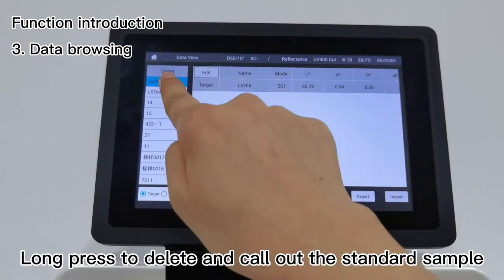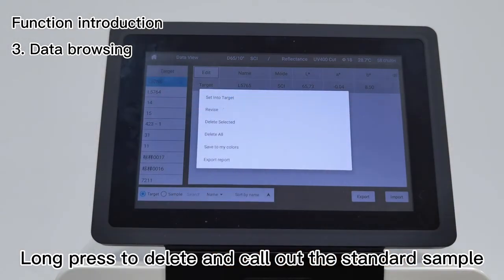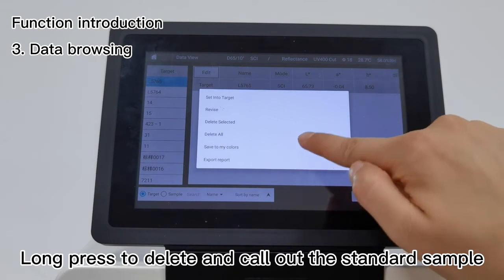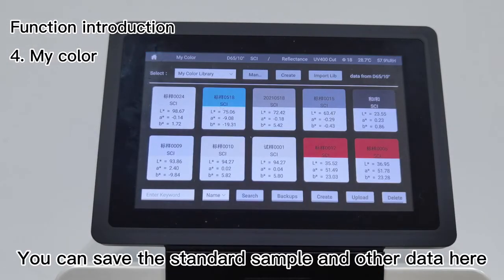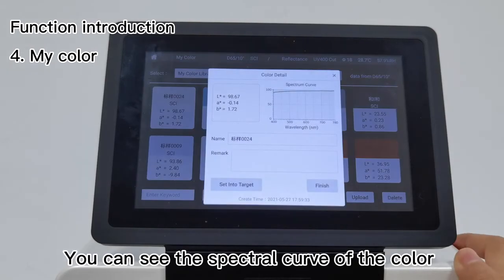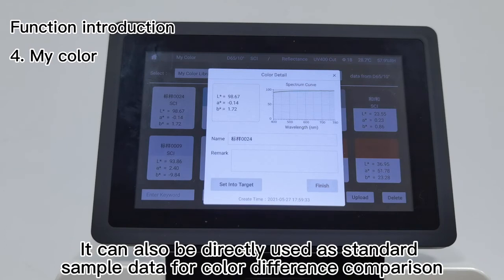Module 4 - My Colors: You can save the standard sample and other data here. You can see the spectral curve of the color. It can also be directly used as standard sample data for color difference comparison.